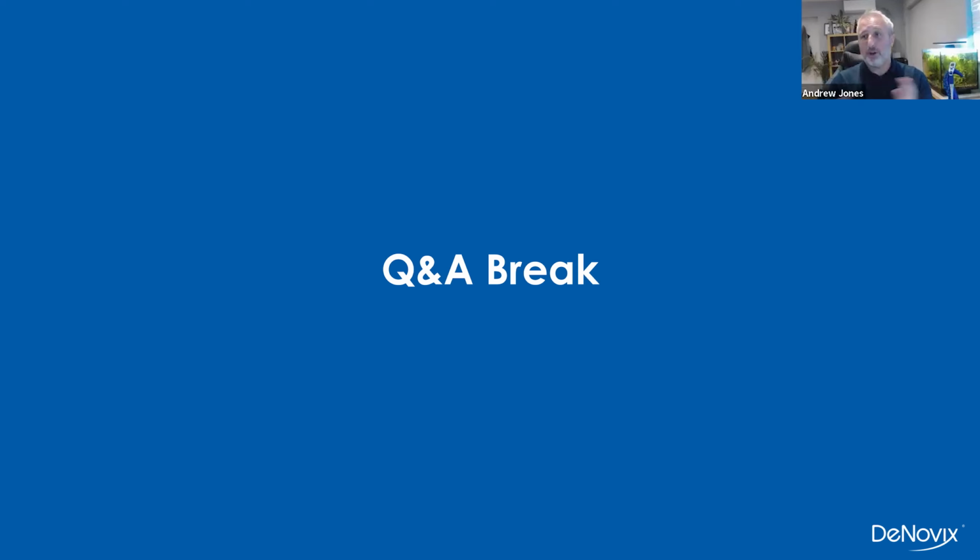Thanks, Corey. We've got a lot of questions come in, so maybe we can make a start on those straight away.